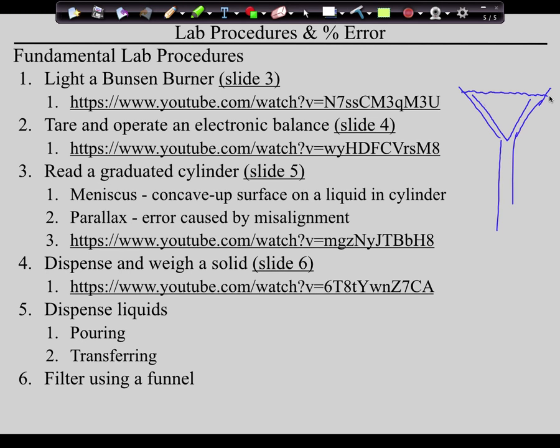So then the question becomes, why do they put a stupid scale on the side of them anyway if it's no good? And the answer is because you want to have a ballpark idea of how much you have in here, but it even tells you right on the side, plus or minus 5%. These are not meant to be accurate. When they cast the glass, there's imperfections in the glass, and they don't account for them.